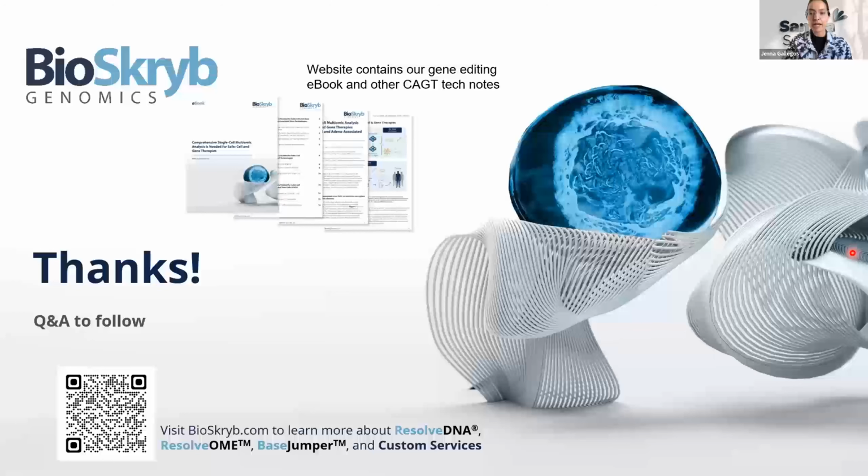And in terms of your results, what was the percentage of each on-target versus off-target event for each mutation category? And do you think you reached saturation or captured all of the events? I do feel like we captured them, because we really looked over this data with a fine-tooth comb. With the on-target that I showed in the plots earlier, even though I showed 1, because I can only show 1 axis, there's probably about 10, 12 that are happening right on target across those 5 cells for each guide. Even the same cell might be edited multiple times, which we do see. If you open up the genome browser, you can see it.